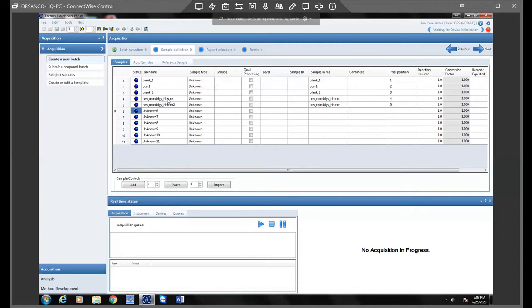So here is where there's the HHMM for hour and minute. To edit it, you can just double click it, and then we would just change the raw to raw underscore 06 25 20 underscore, and then we'll just pick a time. We'll just say 12, and then go ahead and edit all of your raw samples similarly.